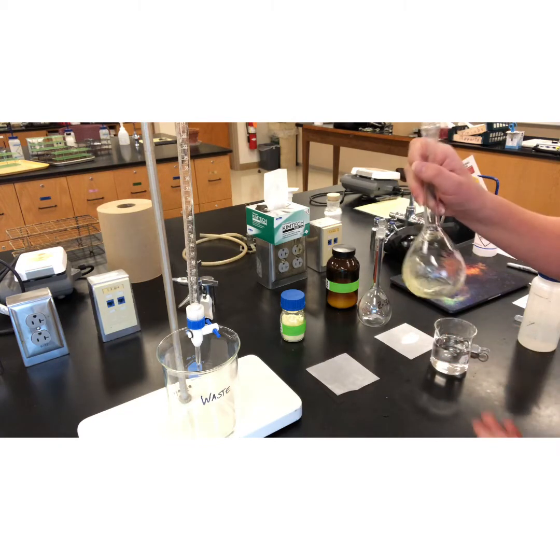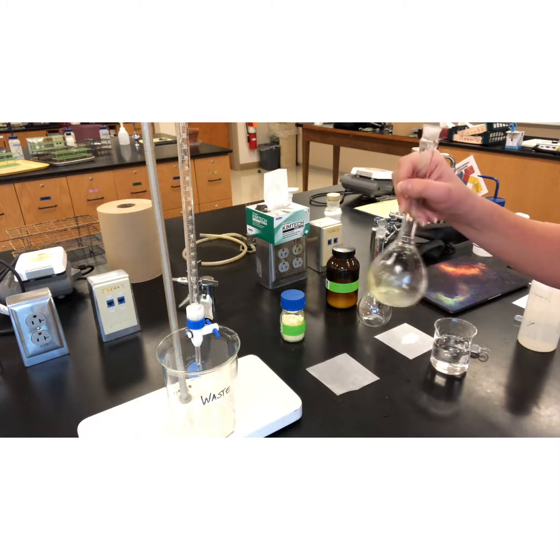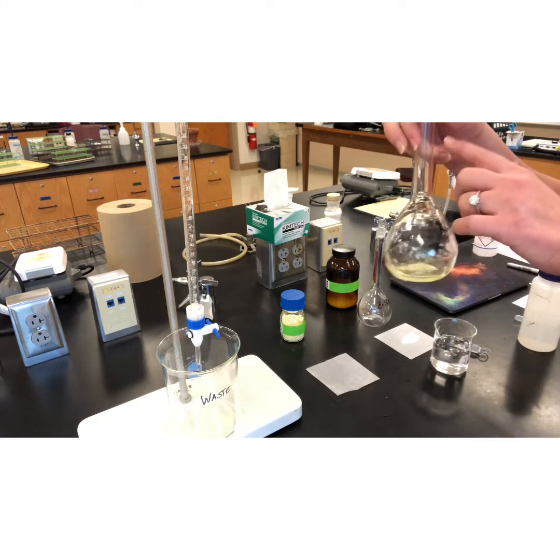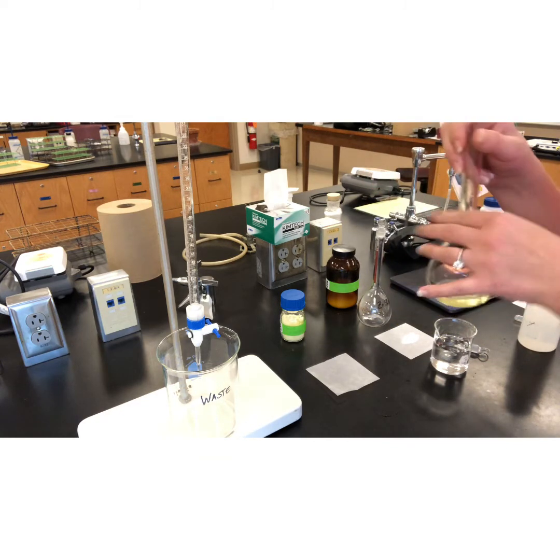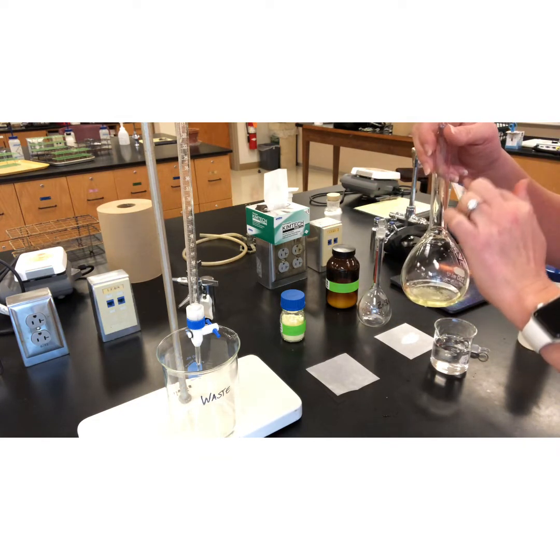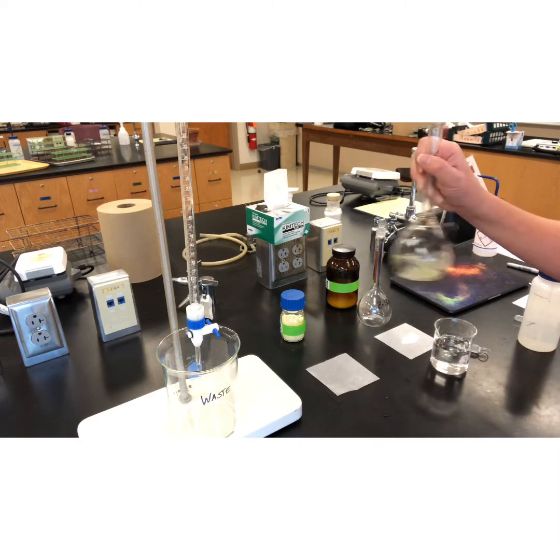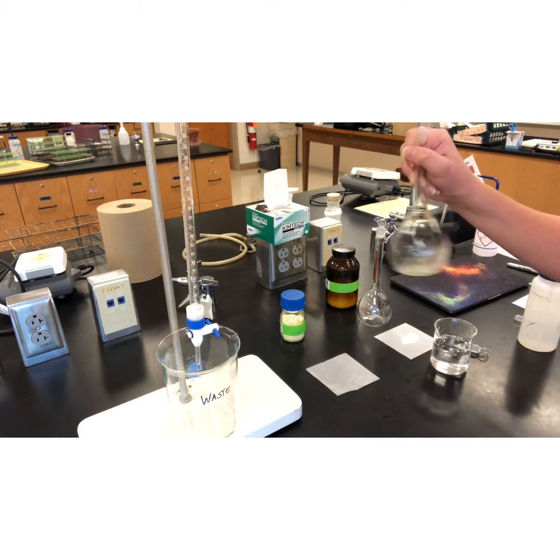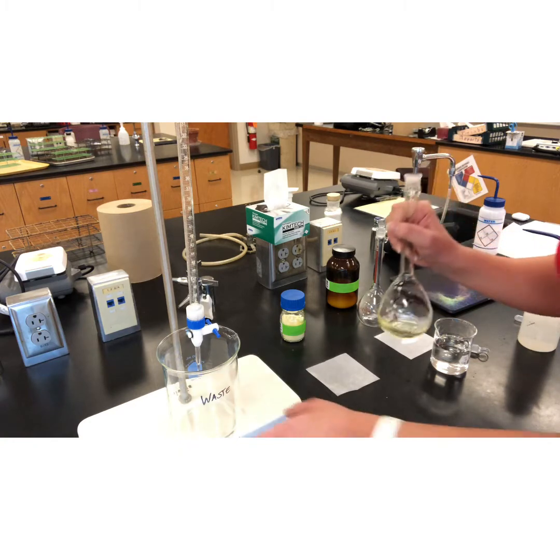Now that I've got some water in, I'm going to swirl my solid to dissolve it, and then I'll continue to add water. When I get close to this mark here, which is super hard to see on the camera, I'm going to take it very, very slowly, so just the bottom of my meniscus is at that line, indicating that I have exactly 250.00 milliliters of solution. I've labeled it so I know which solution is which, because we're going to be working with two different solutions here. I don't know if you can see this. You can see this right here.